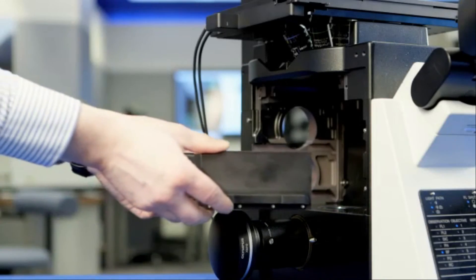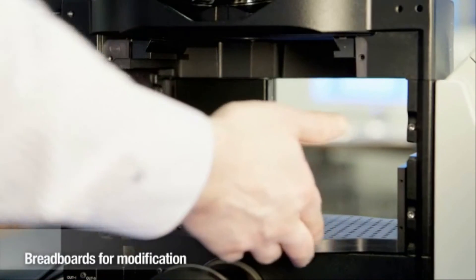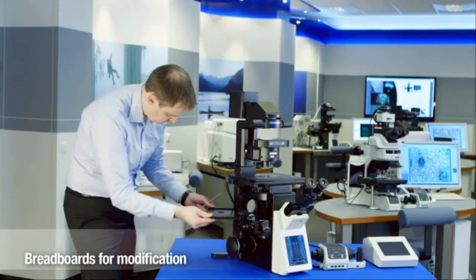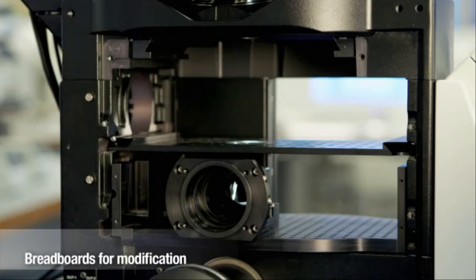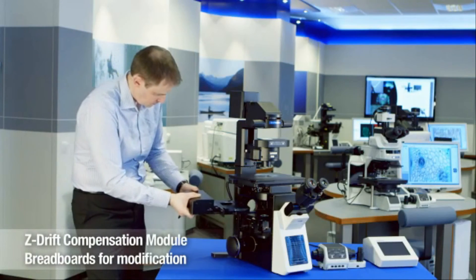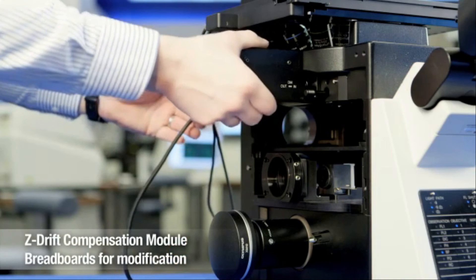The Olympus breadboard support for third-party modules allows users to set up their own customized systems, which is where the concept of open source microscopy really comes into its own. Although the IX3 frames are used with custom modules, users can still access the benefits of the Z-Drift compensation module.